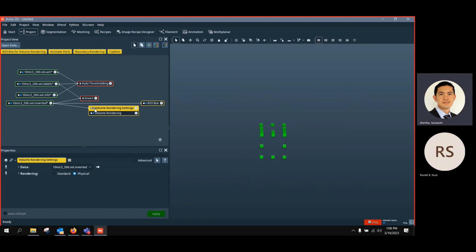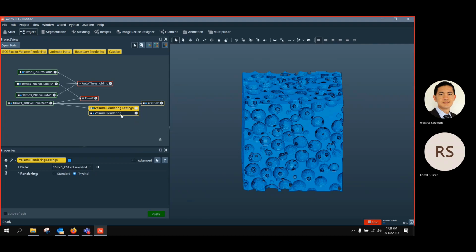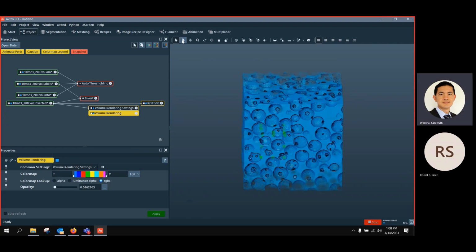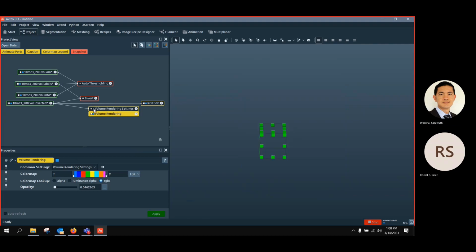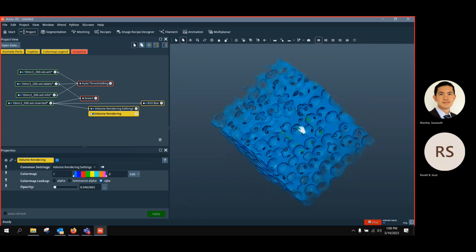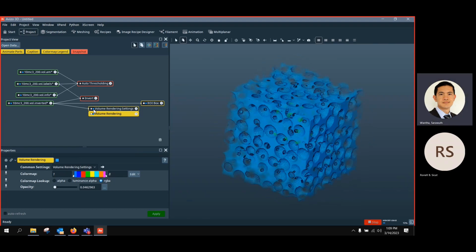So I'm trying to move it a bit. I don't remember the dimensions by heart, so I have to just try to figure out where would be just the center. I think that should be enough to do the job.